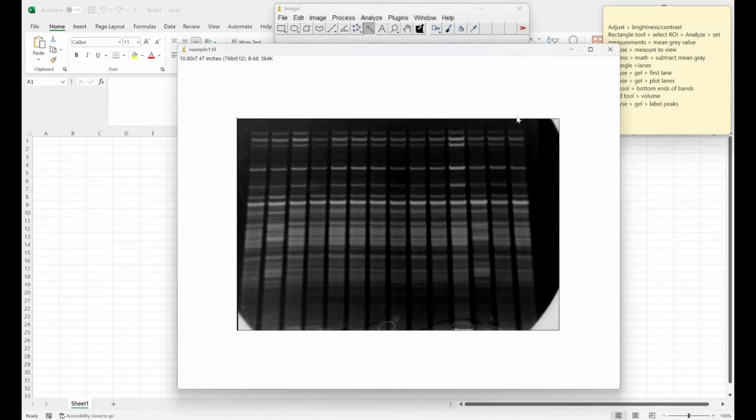Now I know ImageJ doesn't have any built-in kind of PDF reporting, so the only comparable mechanism is measurements that I can take into Excel. So that's why I've got a blank Excel document open in the background there. So I've been watching a few tutorials on YouTube on how to do this.